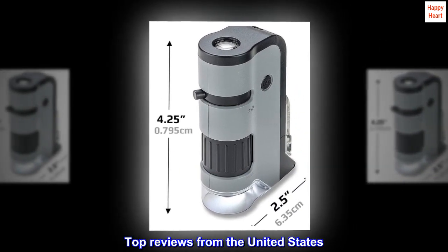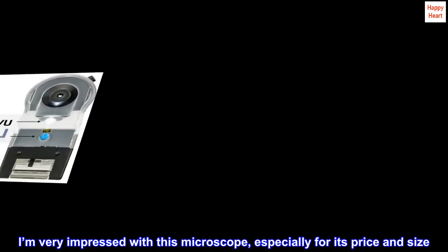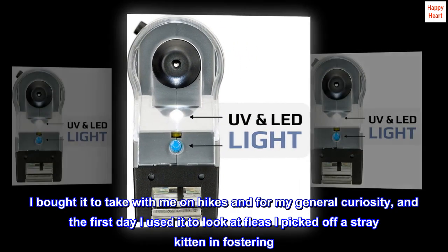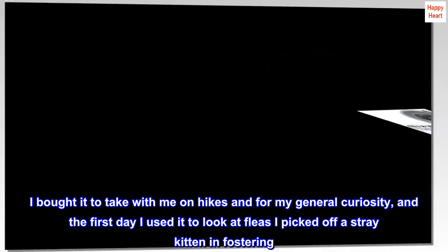Top Reviews from the United States. I'm very impressed with this microscope, especially for its price and size. I bought it to take with me on hikes and for my general curiosity. The first day I used it to look at fleas I picked off a stray kitten I was fostering.